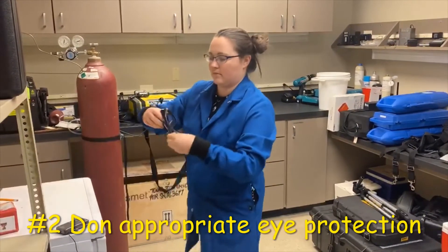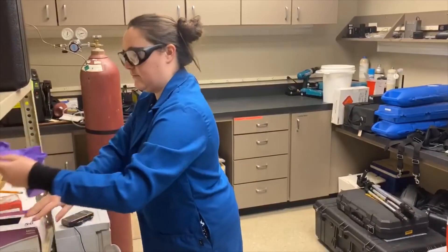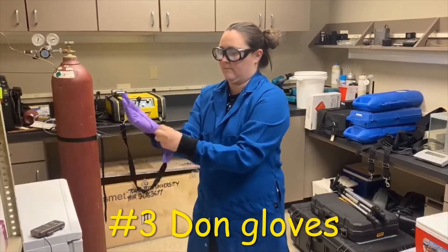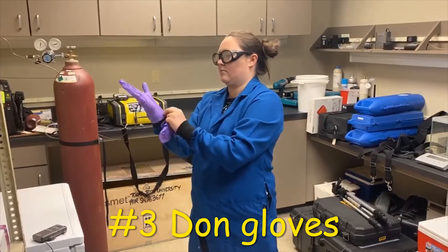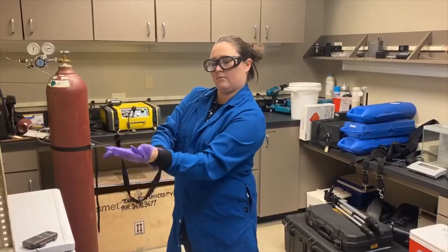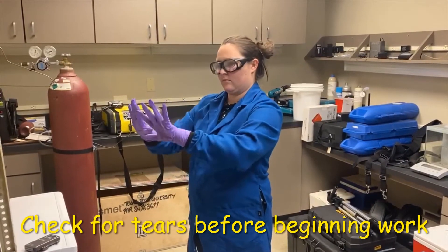The next step in donning is to put on appropriate eye protection, followed lastly by donning your gloves. Choose gloves appropriate for your materials and ensure that the glove cuffs cover your lab coat cuffs. Always check for tears prior to beginning your work.